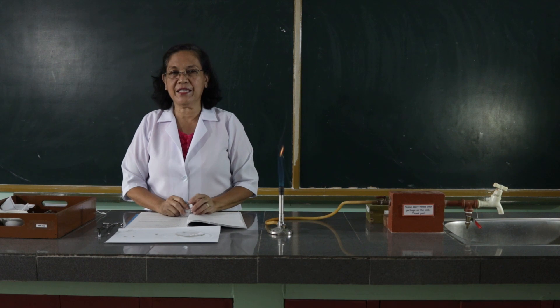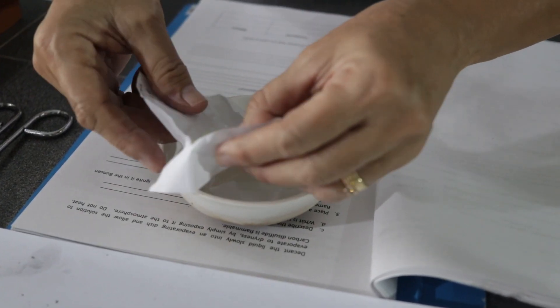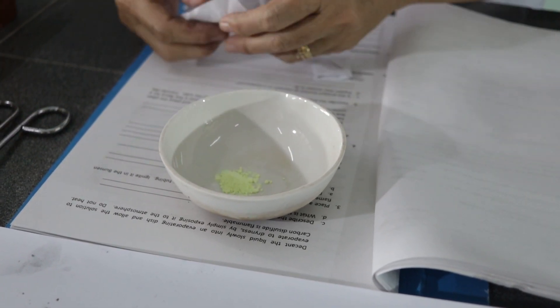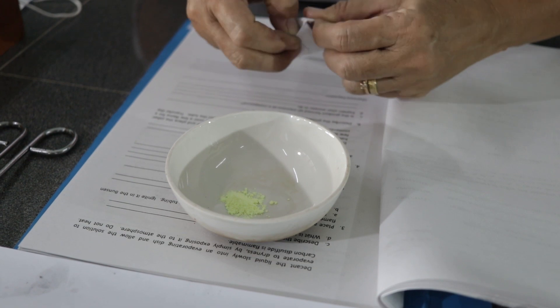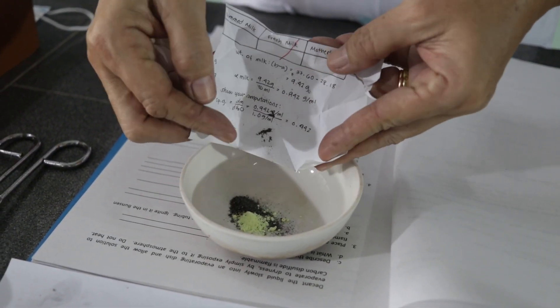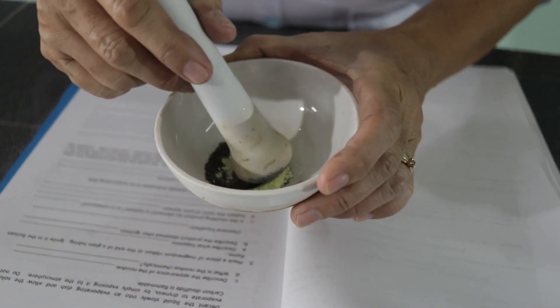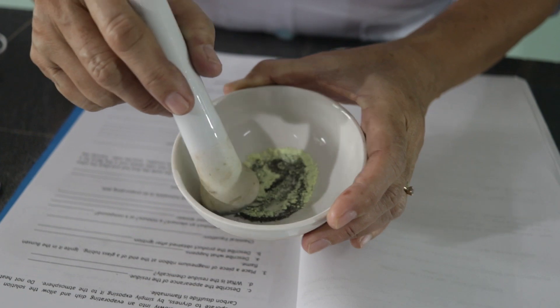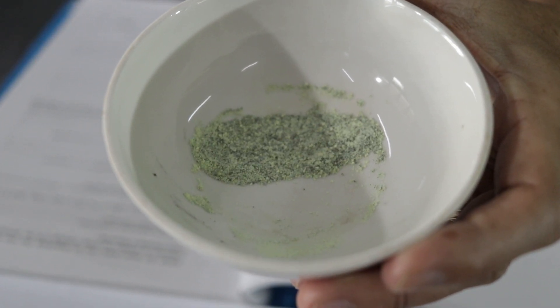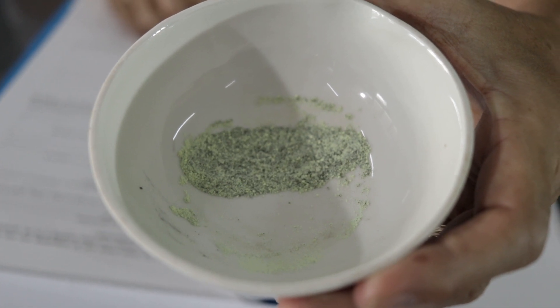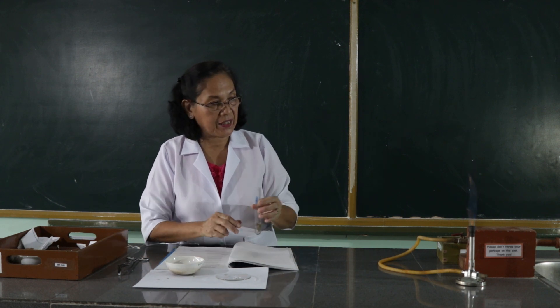The next procedure is, we are going to mix the iron filings and sulfur in an evaporating dish. This is sulfur, and we will mix this with iron filings. Observe the mixture.